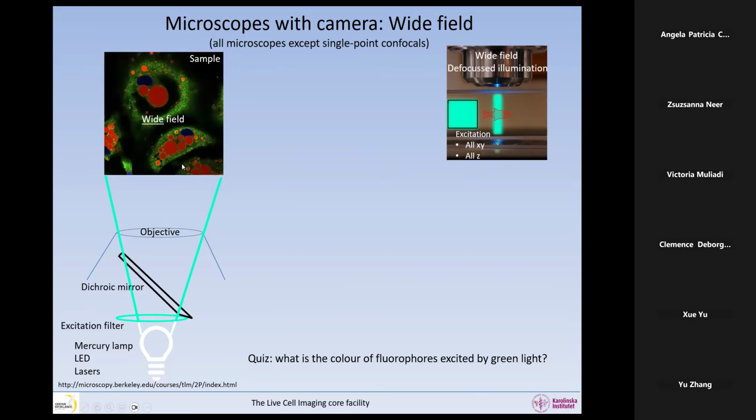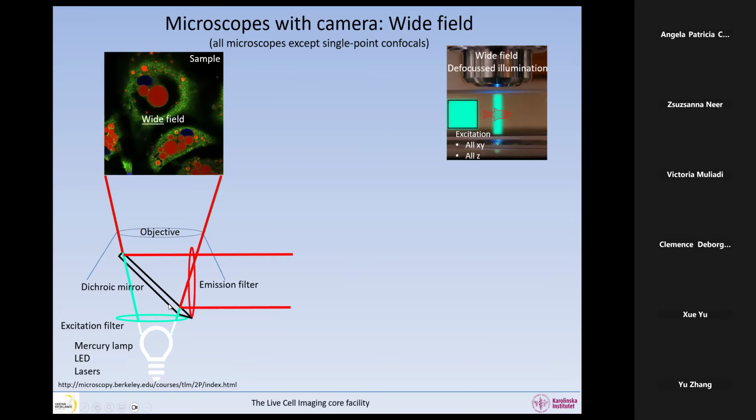And here we go. The fluorophores are excited, and they are spitting out some light, and the whole light comes back to the dichroic mirror. And as you know, the excitation light is eliminated by the dichroic mirror as well, but I haven't represented it here. So this dichroic mirror is going to reflect the emitted light towards the emission filter, which is in here in this filter cube. So we have seen all this before.